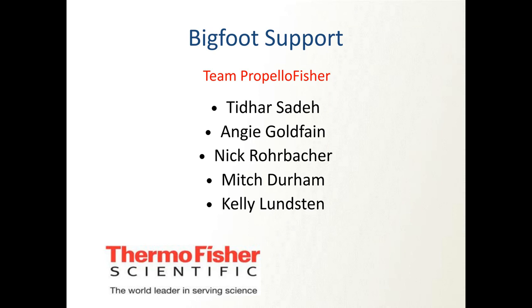Oh my God, these questions are like the trifecta of, needs more work, I don't know. And that's what we're doing now. Like I said, we've hit on that 11 color, and I think the next step would be iterative panel building. To a certain point, you're going to be able to get to what works best on both machines before you have to start bifurcating into adding this color will work better on this machine or that machine. And I can tell you right now, probably at 15 or 20 colors, you're going to start seeing a panel work better for one or the other.